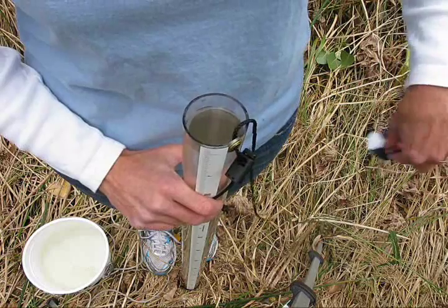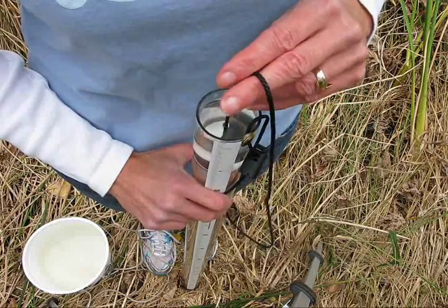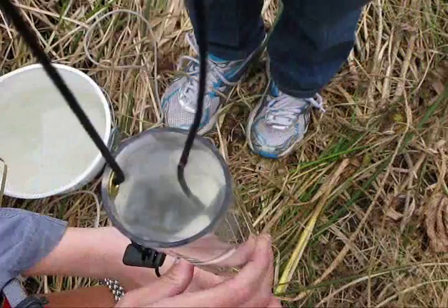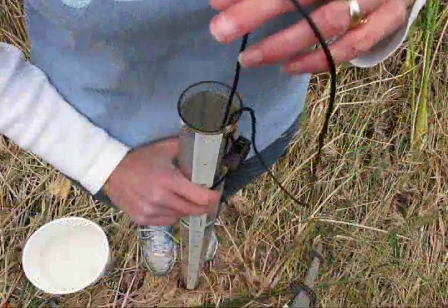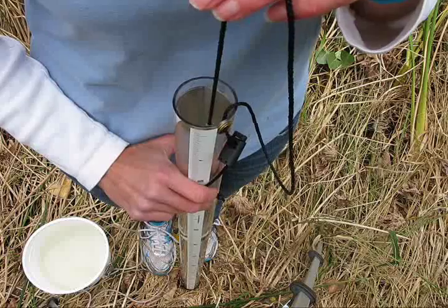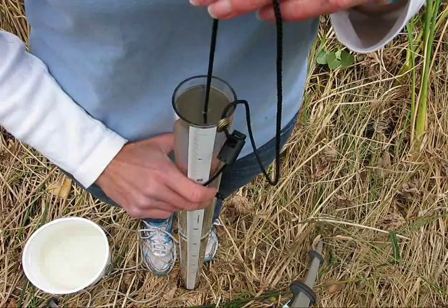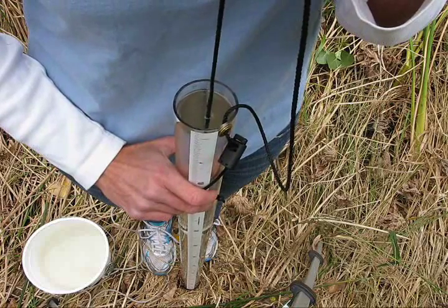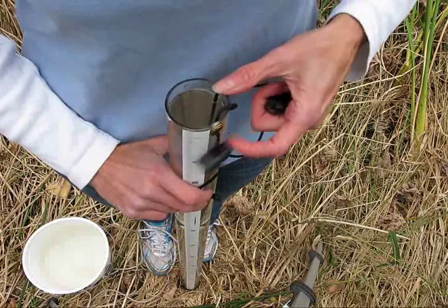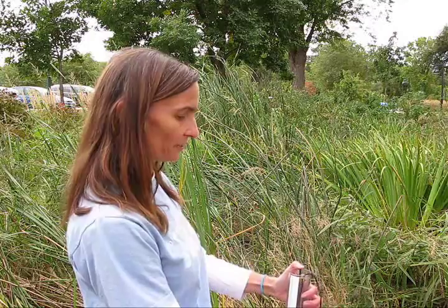Once your tube is filled with your water sample, take the disc and lower it from the top into the tube. While looking down into the tube, lower it until the disc disappears. Once the disc disappears, raise it again until it reappears. Do this as many times as you need to until you're comfortable with identifying the midpoint. Once you've identified the midpoint, pinch the string against the side of the tube with your thumb, making sure that you hold the string on the side of the tube with your thumb.